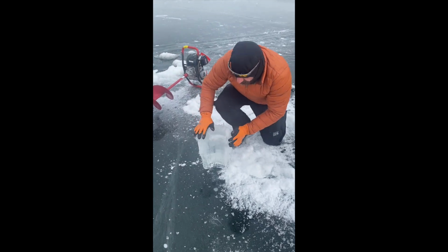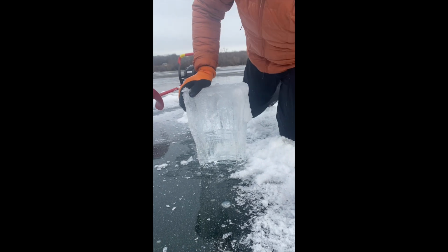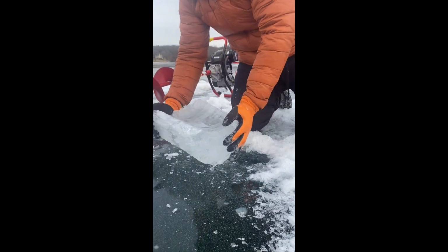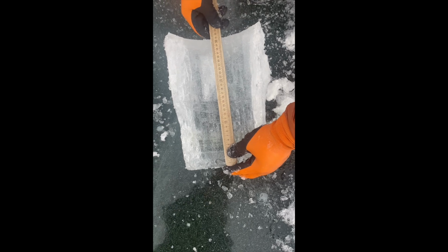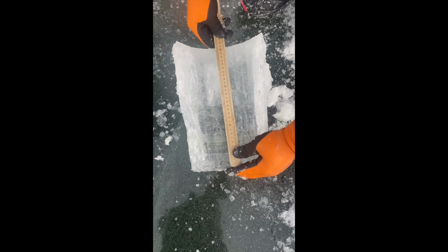Nice. So as you can see, a nice layer of clear black ice. We're gonna get our meter stick. Interesting. I don't know if you can see, there's an interesting greenish inclusion in the ice here. Kind of neat. Okay. So gonna measure the ice thickness. Looks like pretty much 31 centimeters. 31 centimeters.